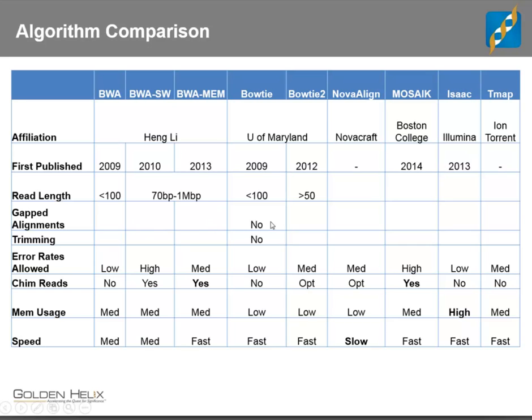And so most tools, alignment algorithms, can handle that. And they basically, after a certain length, when they notice that the quality scores on those base pairs drop, they just sort of soft clip them out. And I'll talk about what that means later. Bowtie does not do that. You have to be aware of that if you're going to use it. For using it for things like ChIP-seq or RNA-seq, if you're just doing quantification, you just want to know the raw number of reads that go to a given part of the genome, it might still be an appropriate choice.